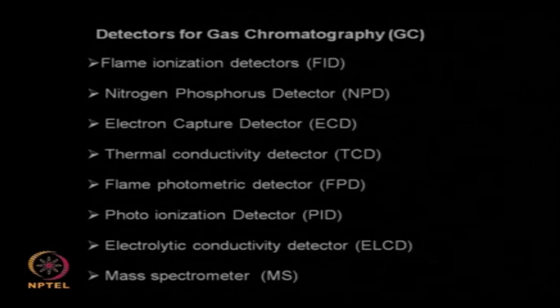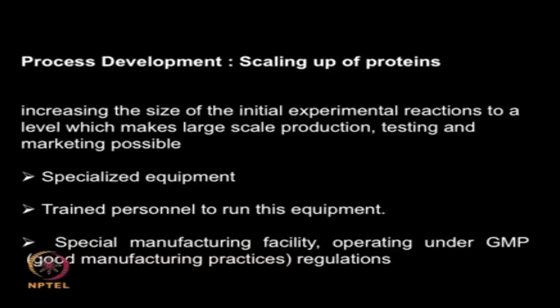So, depending upon the type of molecule you are studying, we can have different detectors possibly incorporated into your system. So, when you are scaling up proteins, let us go back to proteins again.